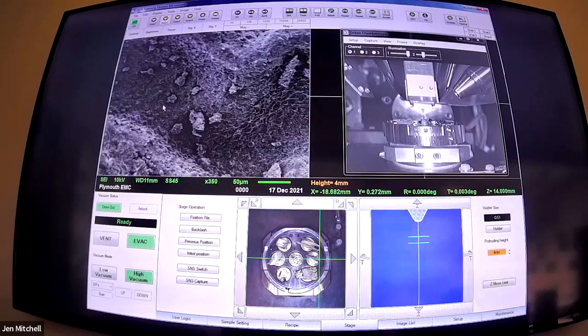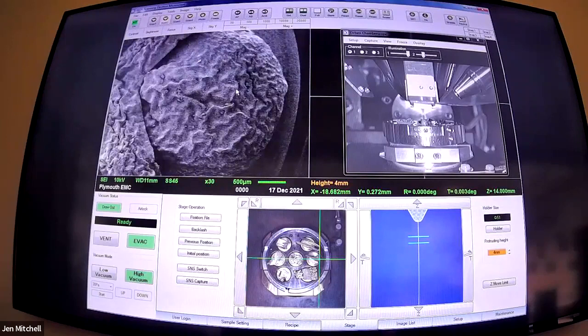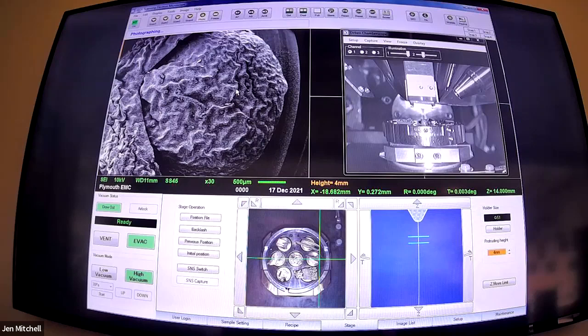I'm going to zoom all the way in and get a bit of focus. Secondary electrons are also really good for getting a depth of field, so things that have texture and topography you can focus through and get quite dramatic pictures. Now I can zoom out and that whole thing should be in focus in theory. Because you're working with a very narrow beam of electrons, it passes through a series of apertures in a column to make it very narrow. That means the depth over which your beam is small enough to get a focus point is a lot greater than with a light microscope. You can see it coming into that slow scan speed as we photograph it.